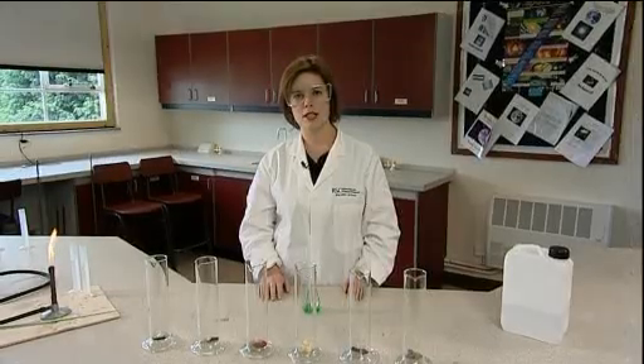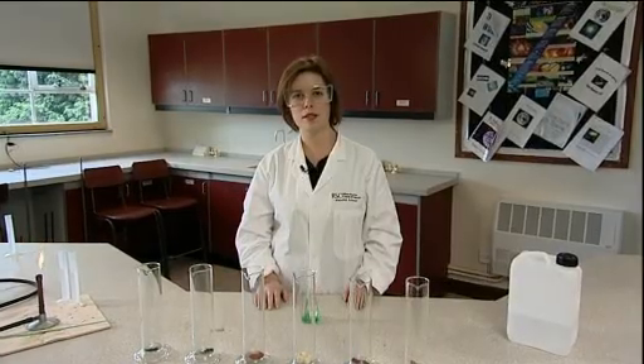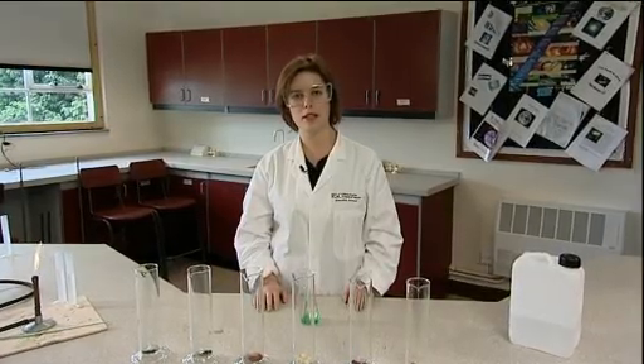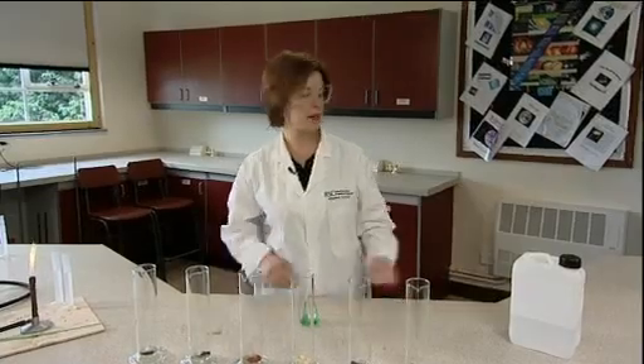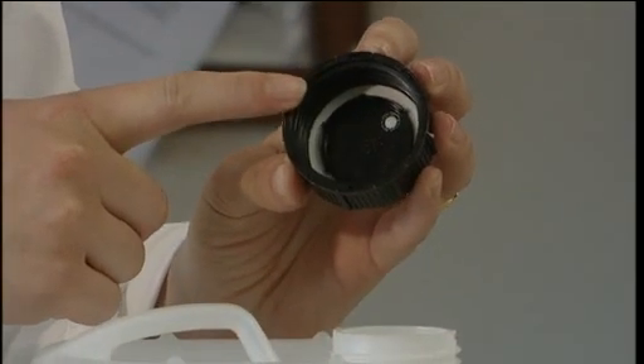Before moving on to the demonstration, it is important to establish for the students that hydrogen peroxide is indeed decomposing all the time, otherwise the students may confuse reactants with catalysts. One possible way of doing this is to show that the bottle of hydrogen peroxide is vented to allow oxygen to escape. Another way is by pointing out that the hydrogen peroxide is stored in a refrigerator and that it has a finite lifetime.